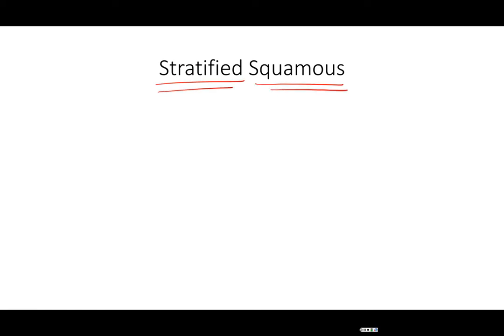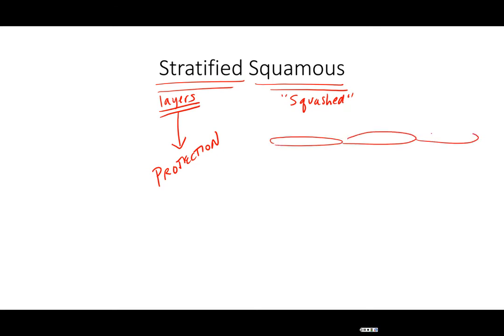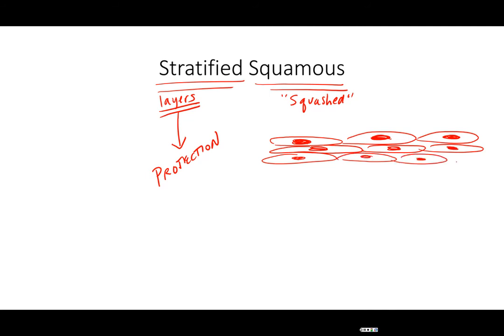Looking at our next tissue: stratified squamous epithelium. Stratified means we're going to see layers, and because we have layers, we should automatically think about this tissue as having the job of protection — it's going to be difficult to get material to cross through several layers of cells. We still have a squashed or flattened oval-shaped cell. Here we're going to be looking at the side view, so you'll see that flattened side with a flattened oval-shaped nucleus, and you're going to see it stacked — that's the layering.